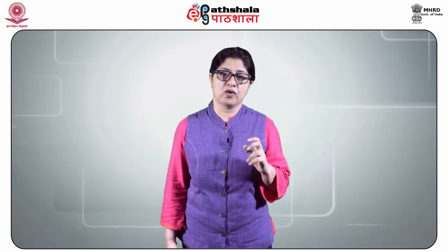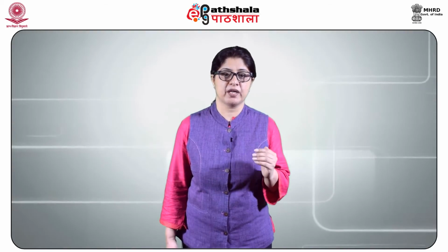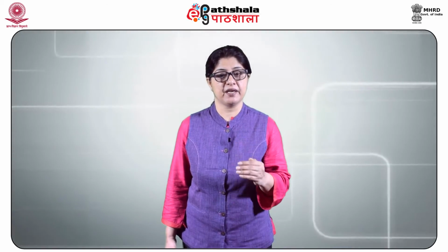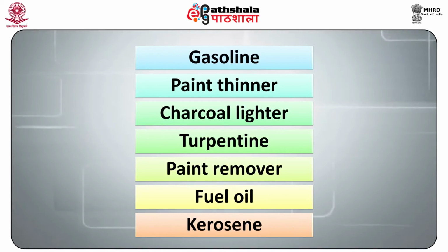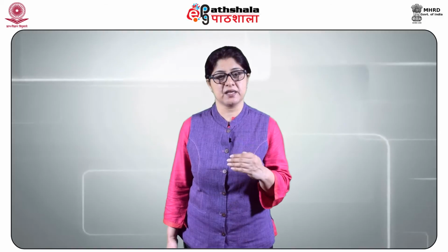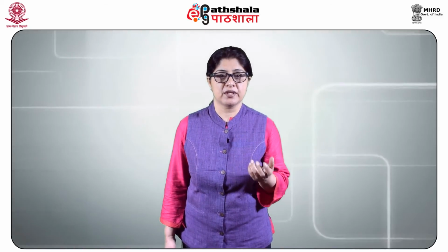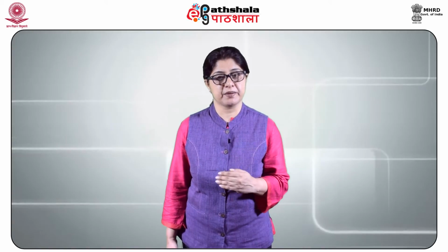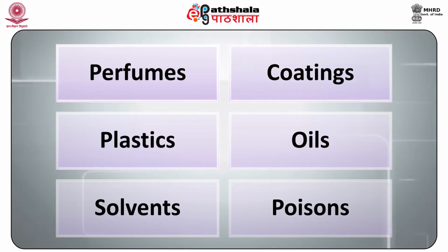Fortunately, evidence of their use is not completely destroyed, even for flammable material of high vapor pressure or when the environment has been elevated in temperature for several hours. Types of materials to be expected include gasoline, paint thinner, charcoal lighter, turpentine and many more. None of these materials are single compounds but definite mixtures, and for this reason identification may be established by preparing a chromatogram. In addition to the applications mentioned in this paper, such materials as perfumes, coatings, plastics, oils, solvents and poisons readily lend themselves to chromatographic analysis.